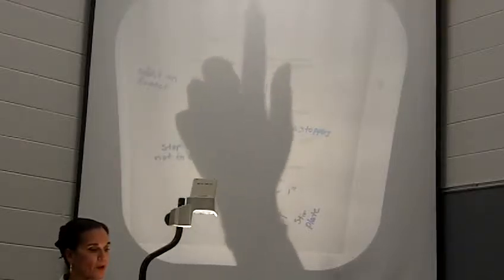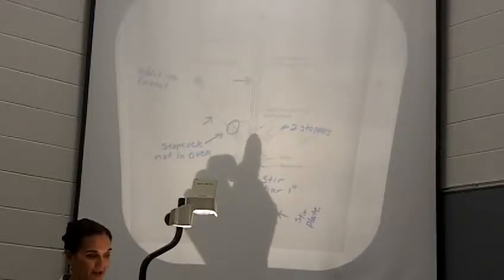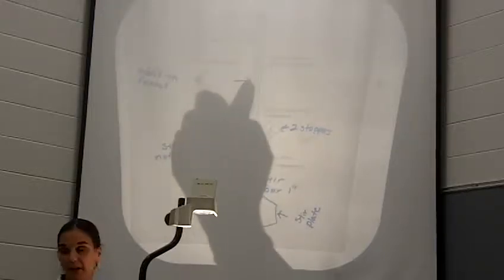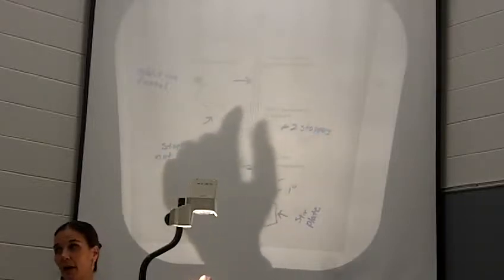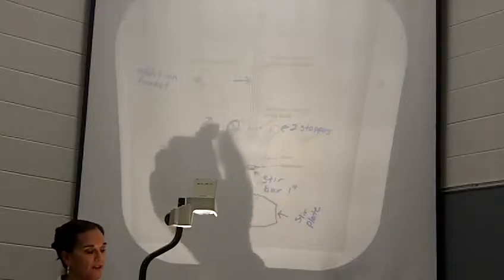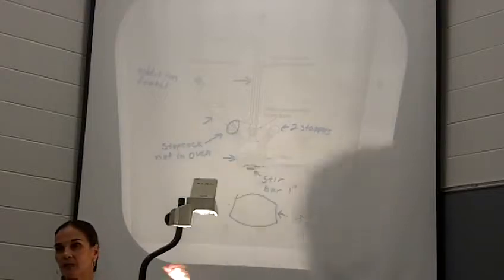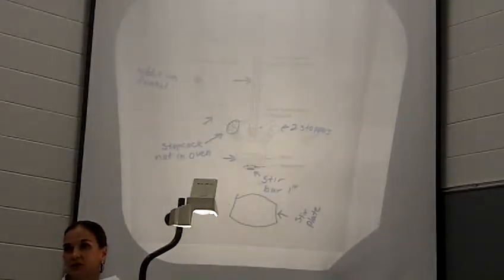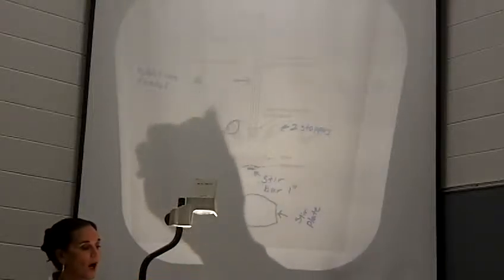So your condenser is going to go in the center, and you want your reaction flask clamped as always, and then you'll have your support clamp around your condenser. Those are the only 2 clamps you'll have on this whole apparatus, okay? Then you're going to put your separatory funnel off to the side, and it doesn't matter which side it's on. I would figure out which side is going to be easiest for you to control the addition of the reagent. So typically if you're right-handed, you're going to want it on the right-hand side. If you're left-handed, you're going to want it on the left-hand side, okay?